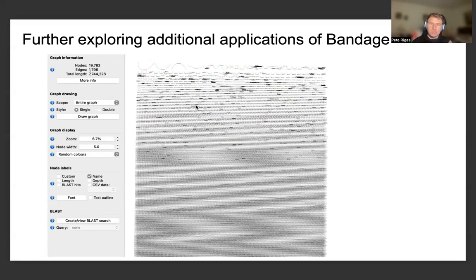because we can see that nearer the top, there are some graphs that have maybe more irregular shapes of the types that we'll be discussing in examples, as well as the fact that there are many other graphs below the ones on the top that mostly consist of lines. And we'll be discussing the difference between graphs that have nodes of lower degree or higher degree, and how this reflects uncertainty in the probabilistic and other types of computational methods used in the transcriptome assembly from Trinity.